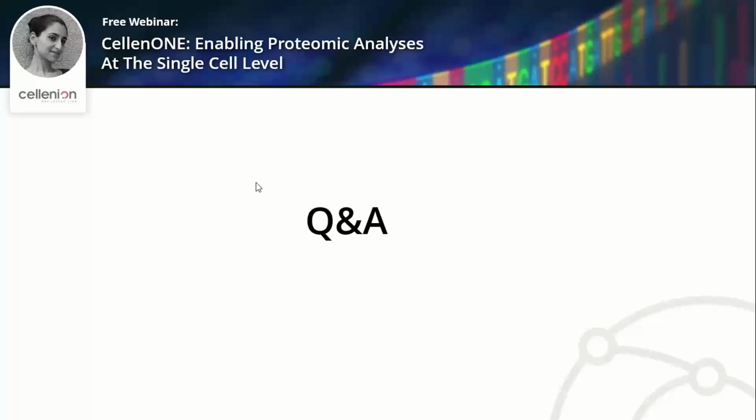Brilliant. So have you tried to analyze smaller molecules with the MS? You mean something else than peptides? I think so, smaller molecules. I haven't personally, so my answer would be no. But for the people using the technique I presented, for the work done in collaboration with the BAM Institute, using the laser ICP TOF MS, yes, they can analyze metabolites as well, I think, because they do analyze metals, so it's smaller. Okay, brilliant, thank you for that.